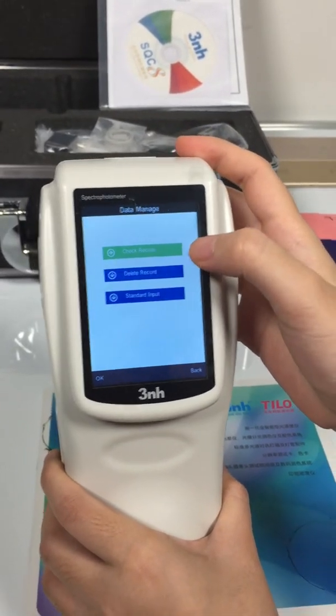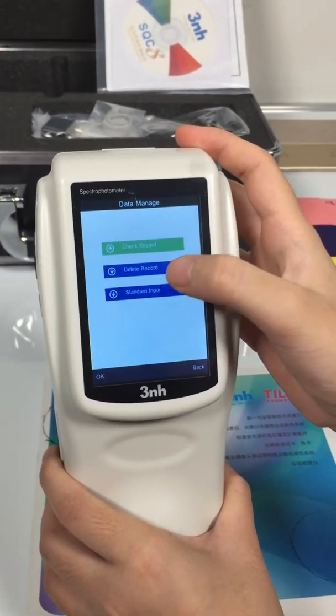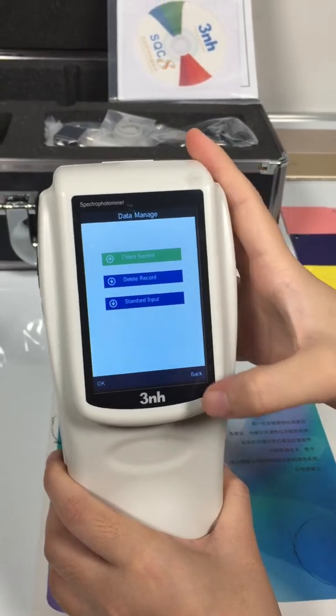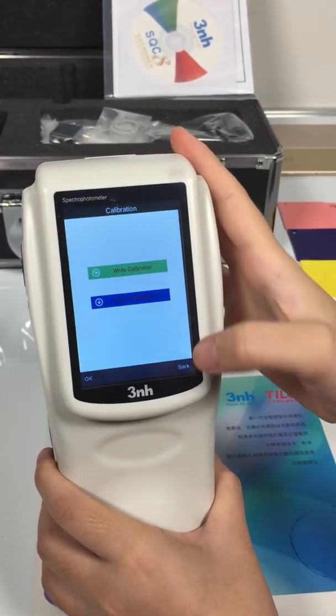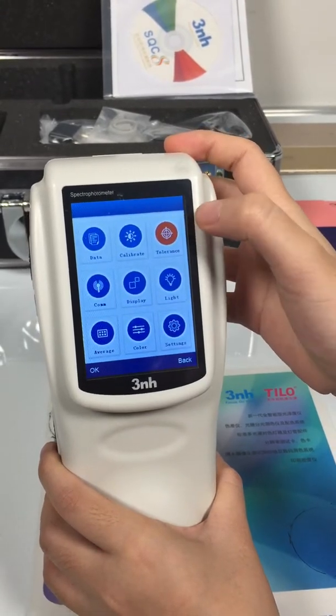We can see the check record, delete record, and standard input. The next one is calibrate, then the tolerance setting.